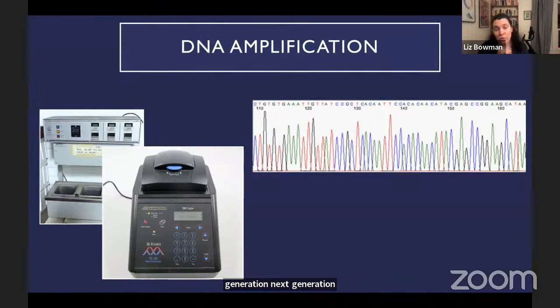So when you do Sanger sequencing, you end up with these chromatograms. And if you notice, there are 4 different colors, and that corresponds to each of the bases. So when it's being sequenced using Sanger sequencing, it uses these fluorescent dyes that flash a color when a different base is detected. And then the computer reads it, and it puts out these really nice chromatograms that tell you what base flashed. And so you get your sequence.